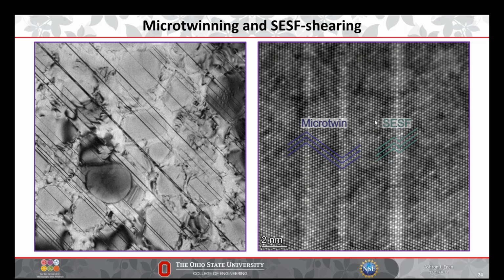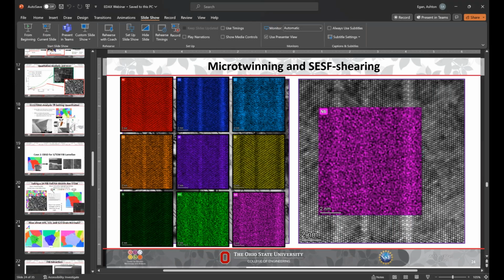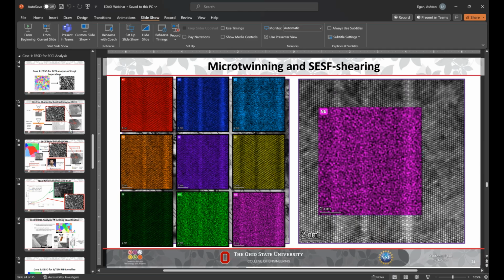Okay. What was the accelerating voltage used for ECCI analysis, and how does it relate with tilt angle and rotation? Yeah, so you can use a couple of different settings. I've done ECCI both at 5 and 20 kV. I think on one of these slides it actually specifies what my settings were for that image.